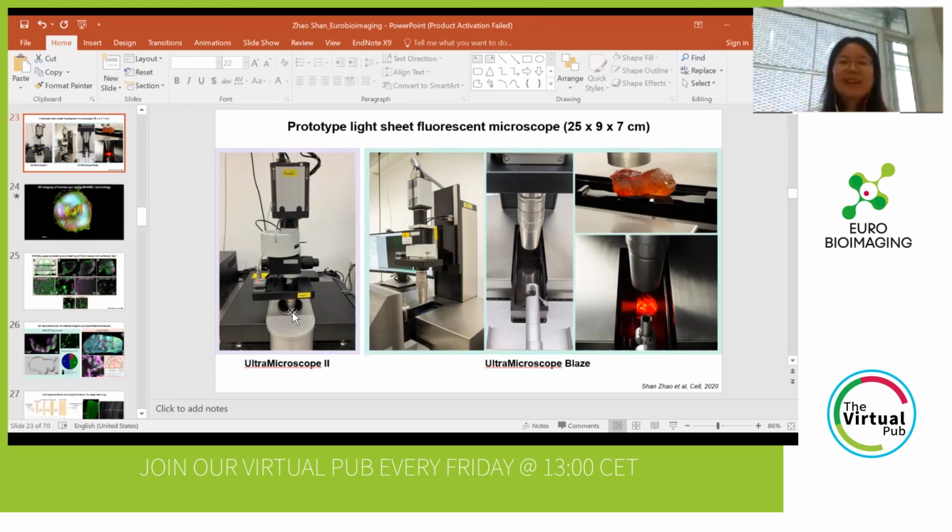In the end, we like to fuse all the different parts together. Generally, imaging one mouse probably takes about 1 month. Right now, with this new light sheet, basically the whole body of the mouse can easily be mounted on the sample holder, and we can image it one time. So right now, we mount the mouse and image one side, and then flip the sample and image the other side, and then fuse them together.